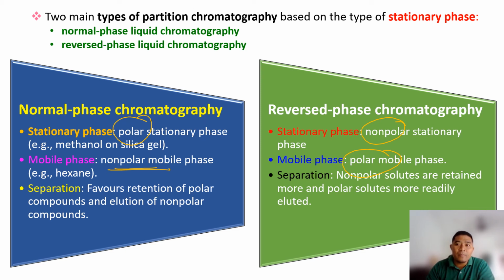Okay, sebenarnya bila guna partition chromatography ni untuk guna high tech instrument, for example gas chromatography and also high performance liquid chromatography, kita boleh tukar dia punya polarity of the stationary phase sebab kita punya nature of samples or analyte awak adalah berbeza-beza kan polaritinya. So kalau kita fixkan saja dia punya normal phase chromatography, polar stationary phase and non-polar mobile phase, susahlah kita nak buat separation yang lain kan. So that's why bagus dia boleh tukarkan benda ni.